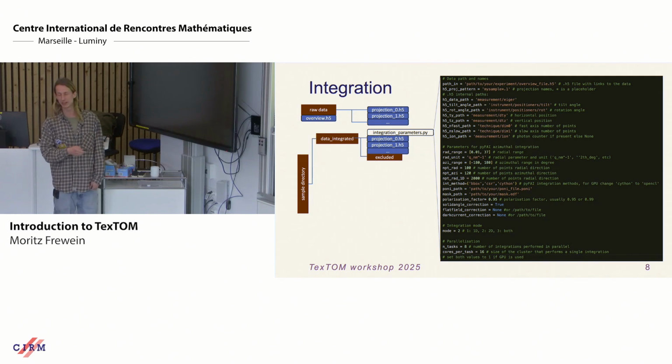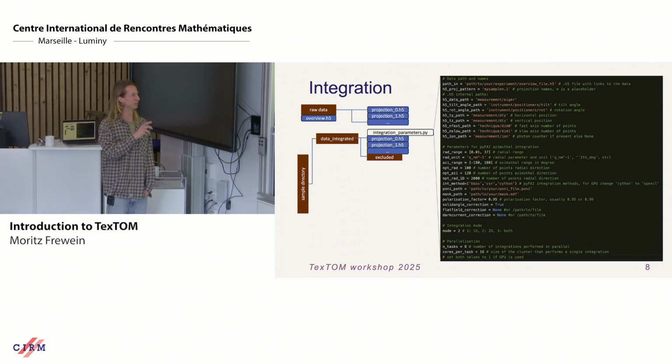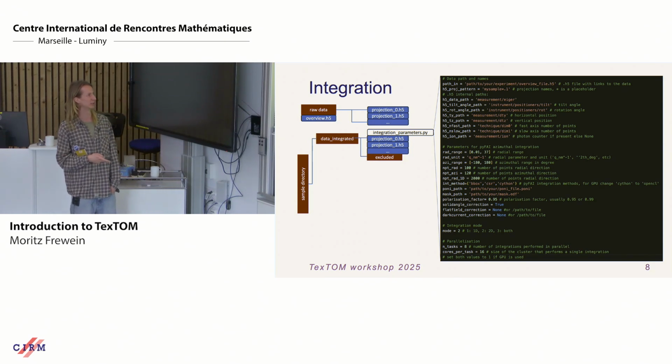There are some files required which you should get with your beam time from your beamline. I would recommend doing an integration with your beamline scientist so you make sure everything is configured correctly. There are also some things for your geometry you have to figure out here. And then there's the possibility to do parallel integration and so on, but you can check the documentation for more details.